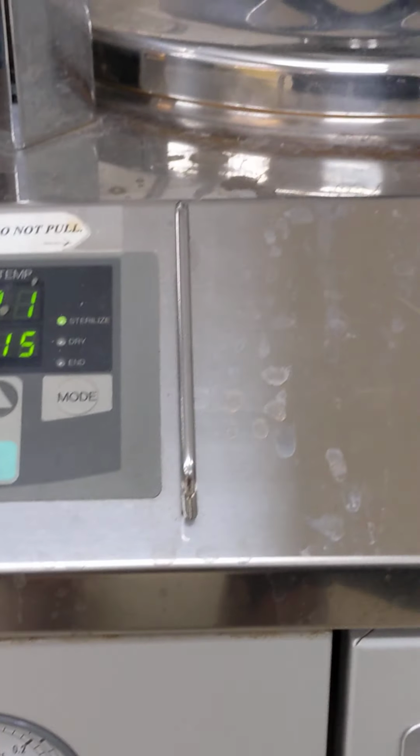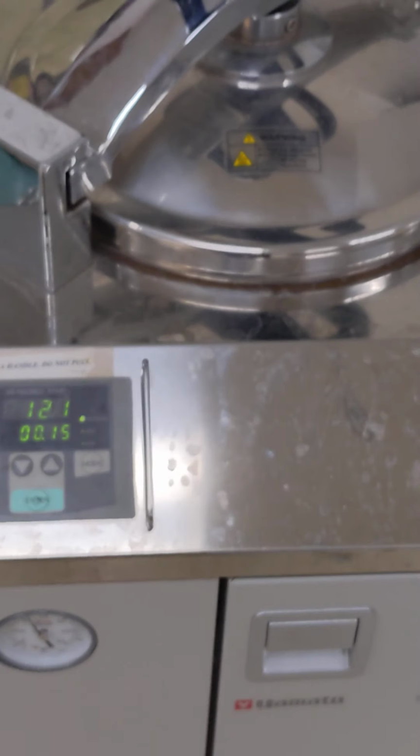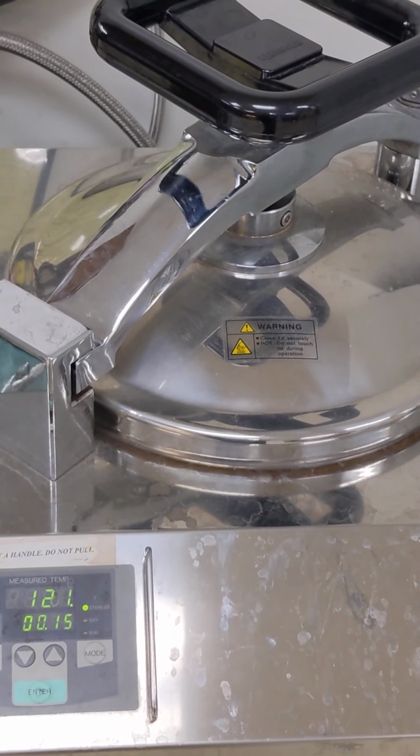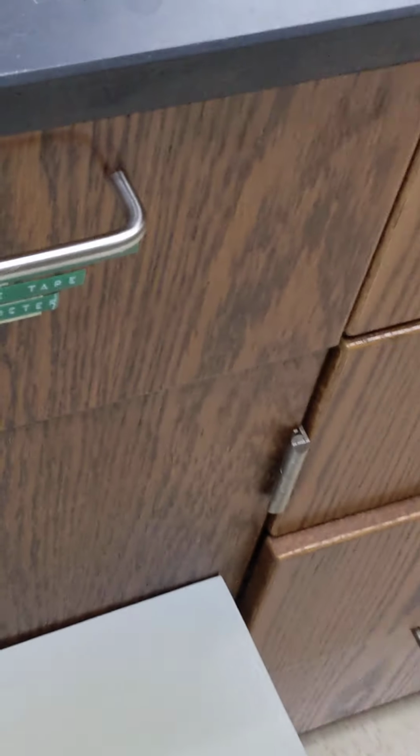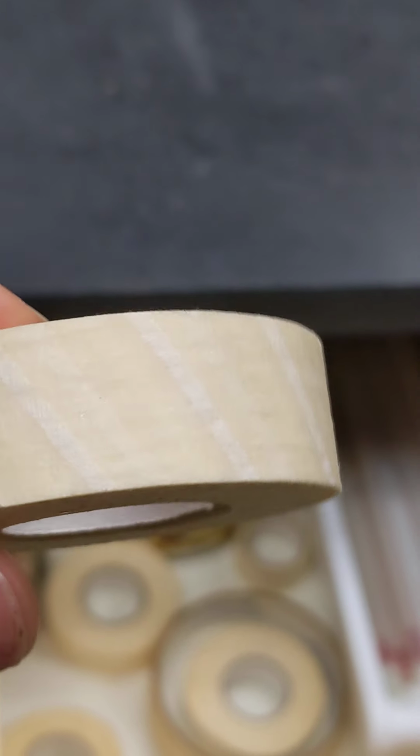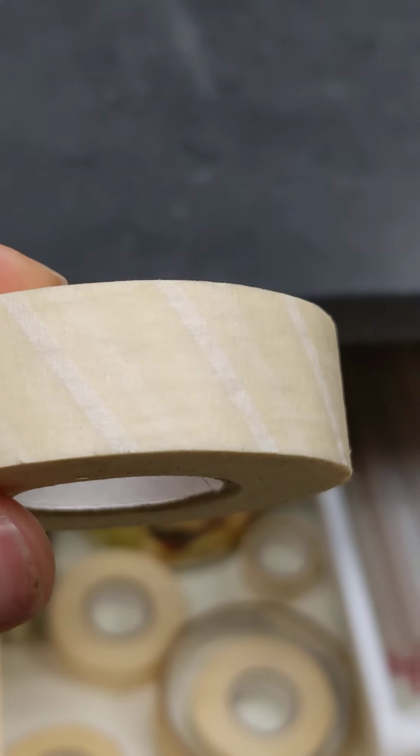Inside of this is a flask of media that's being prepared. It's also got on top of it a piece of foil and a piece of autoclave tape. Autoclave tape is pretty darn nifty. It's one of the things that we can use to make sure the autoclave is working properly. The autoclave tape looks like this. It has a series of white stripes, and those white stripes turn black when we reach 121 degrees Celsius.